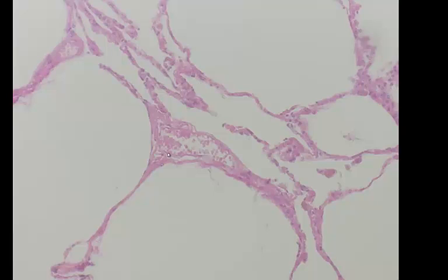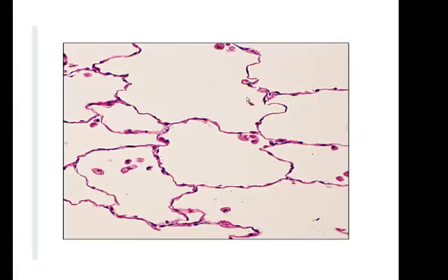And so the reason we want simple squamous cells, little flat cells, and only one layer here is for diffusion. Here's another simple layer of simple squamous cells, a simple squamous cell with this little nucleus, and here's a nucleus. So let's go to the next slide so you can get this search image pattern going.